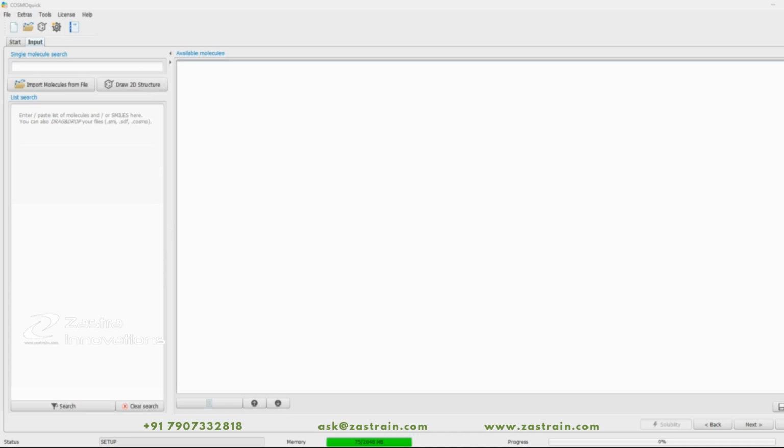So already there is pre-computed COSMO data, and we try to retrieve that for each of the fragments. We stitch them together to estimate the sigma profile. In the COSMOtherm video, we usually calculate the sigma profile, as you have seen, but that particular sigma profile or COSMO-RS surface is generated using quantum chemistry calculation or a DFT-based approach. But here we are not using that. So it makes the calculation much faster, and that can be used to predict properties via COSMO-RS. So let's see what properties we can calculate.